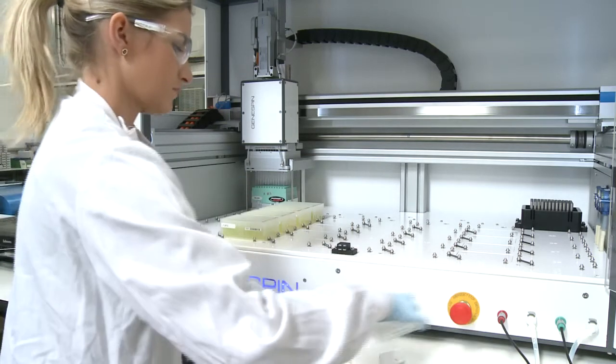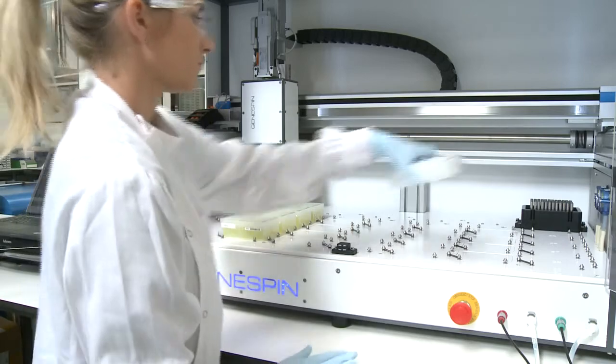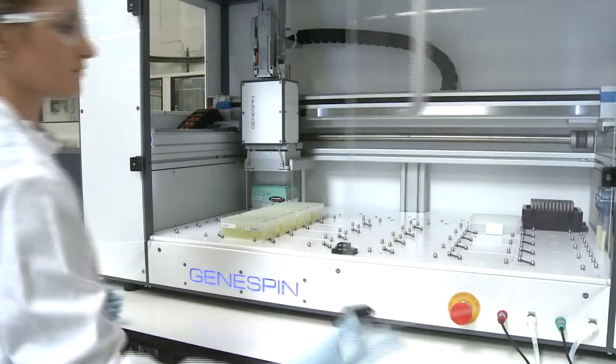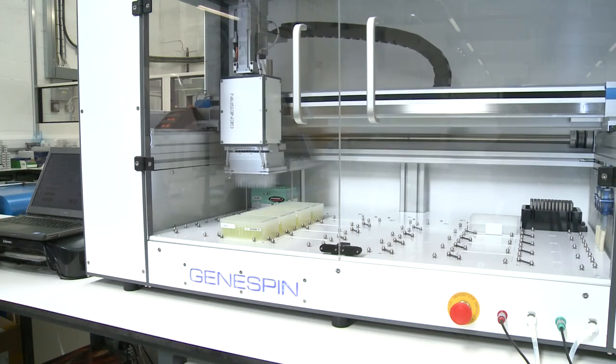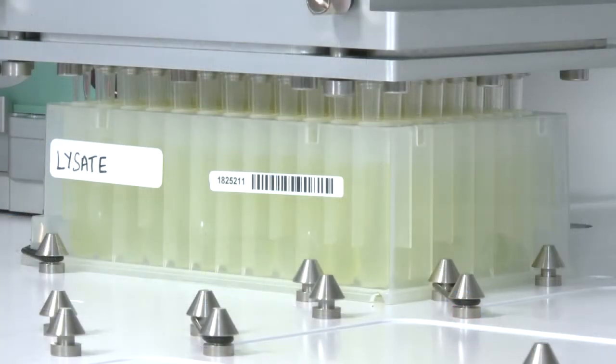The platform manages all of the liquid handling steps on deck and is capable of producing 16,000 extractions per day at a fraction of the cost of other technologies. There is an option to use our patented 384 ion exchange plates to boost throughput. The system is also capable of high throughput replication of DNA into 96 or 384 well plates, so you can extract and then array your samples all in one machine.